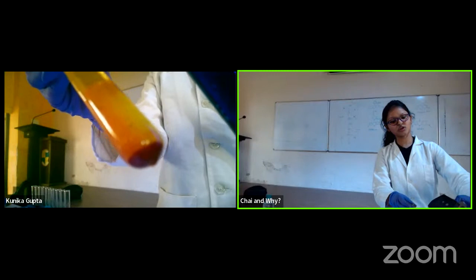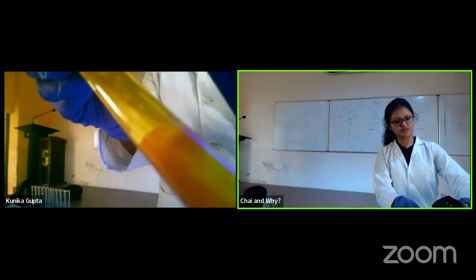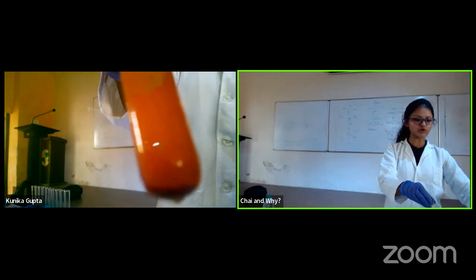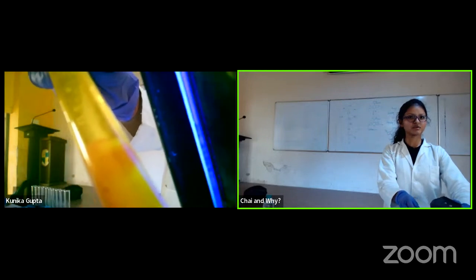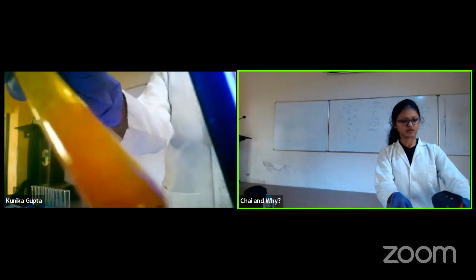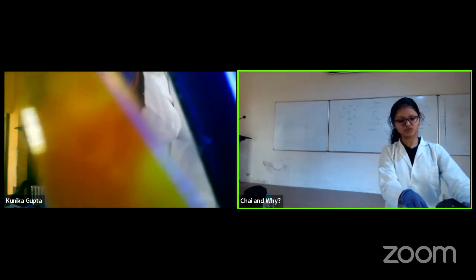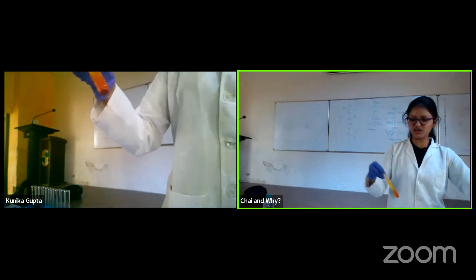Just be a bit quick because it will go away. It's dissolved in DCM. Can you see it? Something glowed yellow. Yes. If I take it out of the UV, you see it orange. If I take it under UV, you see it yellow. You see? Yeah, just put it up. Yep, that's correct. You can see it yellow. For the audience, here this. Okay? And here I'm showing this.